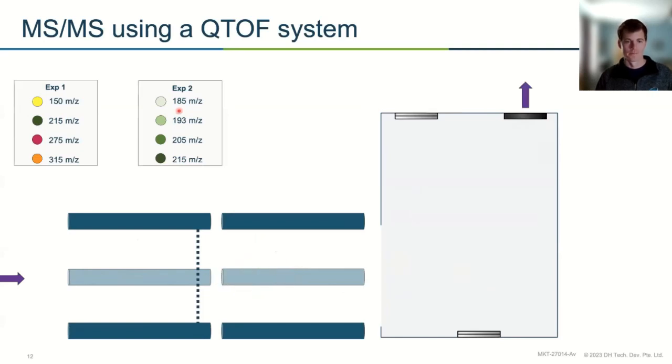I'm going to do it one more time. So the ions enter the analyzer and make their way to the detector. Good. I don't want to just talk over the animations. They're there for a reason, right? Okay, so that's the end of part one.